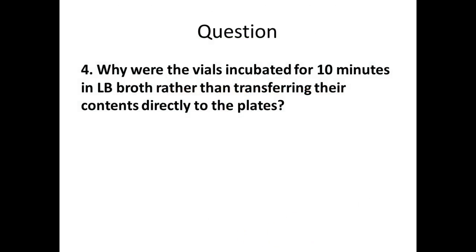So why were the vials incubated? Why are we going to incubate them for 10 minutes after we give them the LB broth, before we put them on the plates? Not necessarily to grow, but we just gave them DNA. That's information. Can they use it? If I gave you the answers to the test, you'd want them. Okay, so we give them this information.